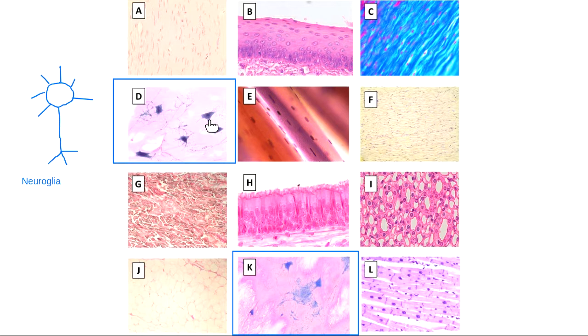Several of the types of tissue on this slide we've actually already talked about. We have not talked about tissue C. Any takers here? What kind of tissue is this one up here, tissue C? Any ideas? Yeah, so we're correct. In tissue type C, we are looking at fibrocartilage. All of my cartilages, by the way, are a type of connective tissue. So fibrocartilage, connective tissue.